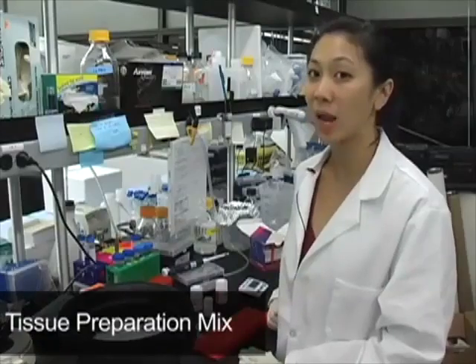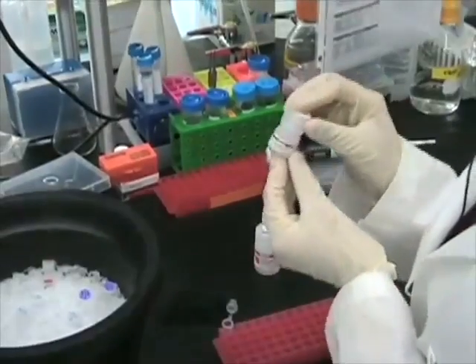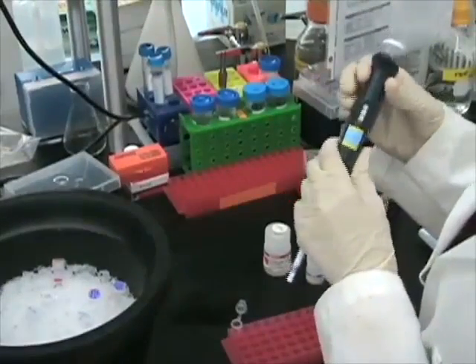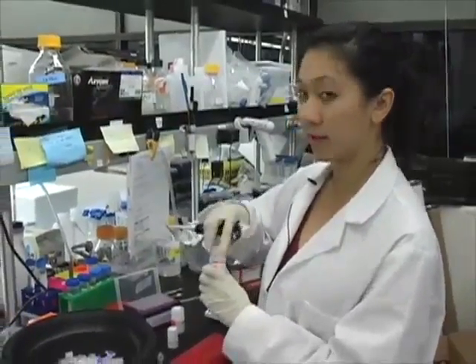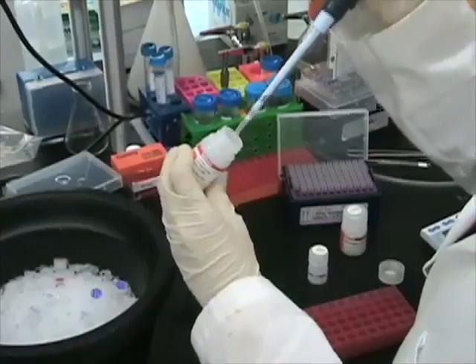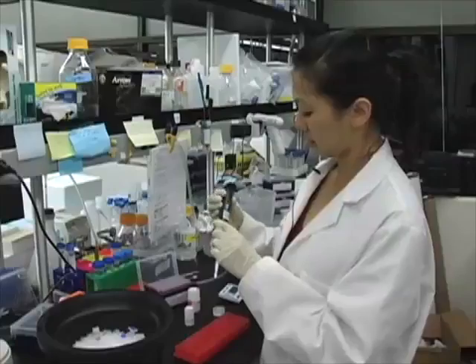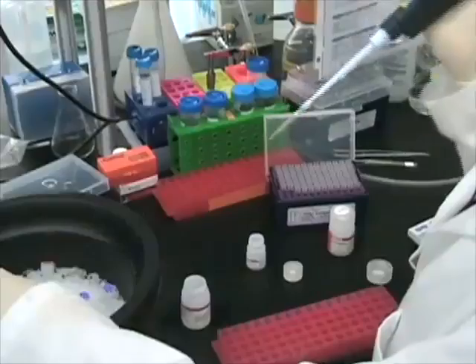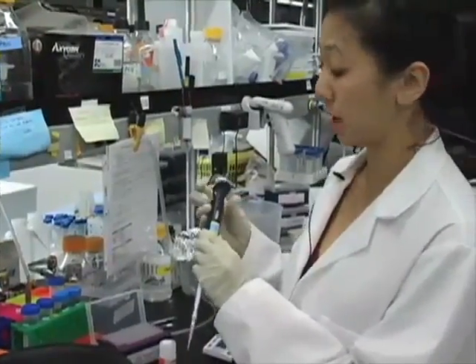First, you have to make a master mix of the tissue preparation and DNA extraction. For each tail, you're going to want 100 microliters of the extraction solution and 25 microliters of the tissue prep solution. I'm going to use my P200 and filter pipette tips to measure out 100 microliters of the extraction solution and 25 microliters of the tissue prep solution into a new Eppendorf tube. You're going to want to mix your master mix solution by pipetting up and down.